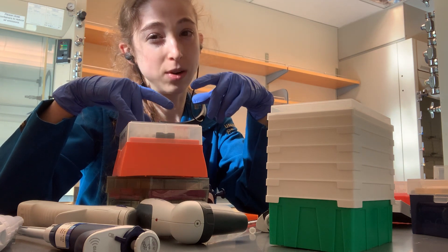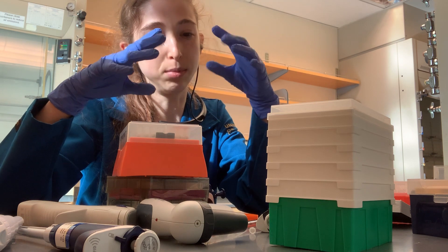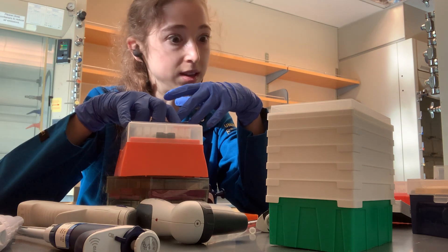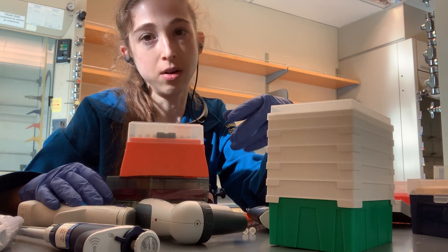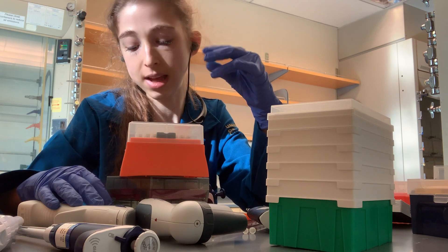The yellow tips are typically for 20 or 200 microliters, red is typically 10, and blue is typically 1000 — but that can vary from brand to brand. The important thing is that you know what size is what and you use the right size with your pipette, or else you're going to potentially suck liquid up into the barrel of the pipette.